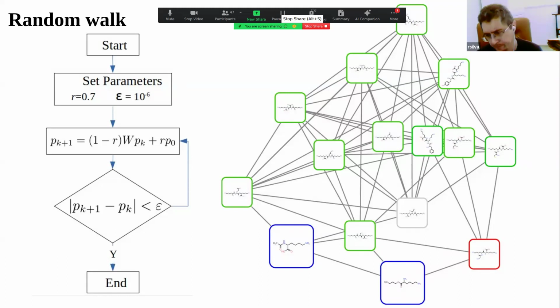different from NAP. So it's an improvement because now we can propagate information on molecular networks for nodes that are not directly connected to the spectral library match. So that's the main idea of random walks for propagation here.